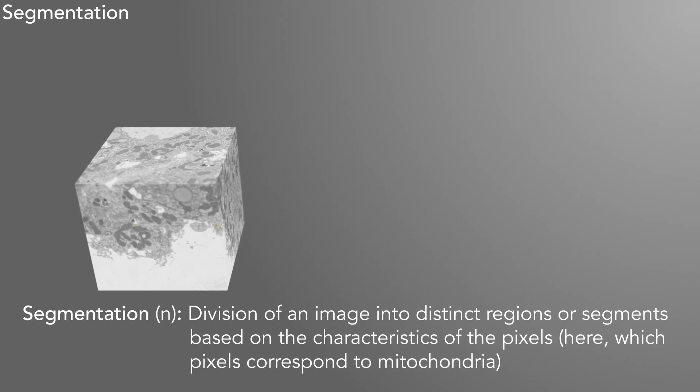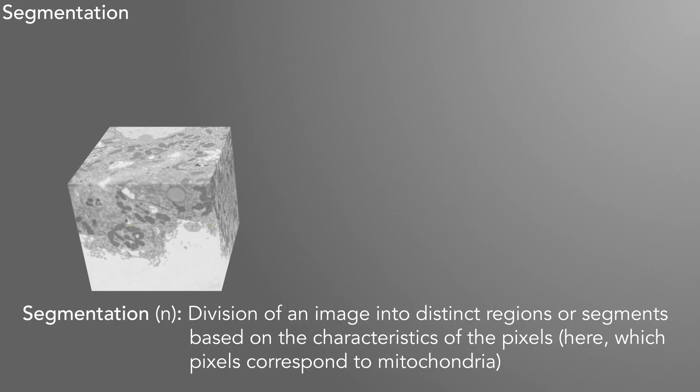Now we may be interested in specific features within this volume, say mitochondria. In order to isolate these features, we need to perform what's called segmentation.